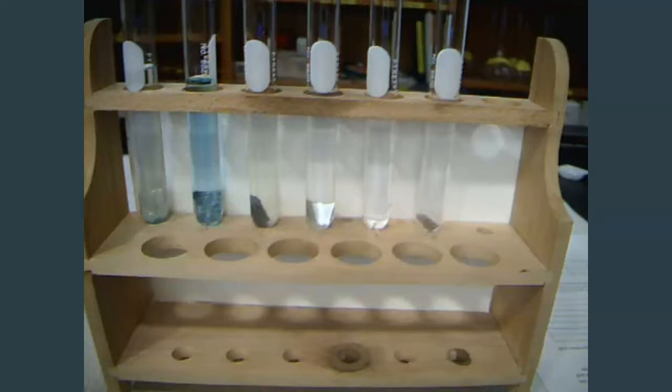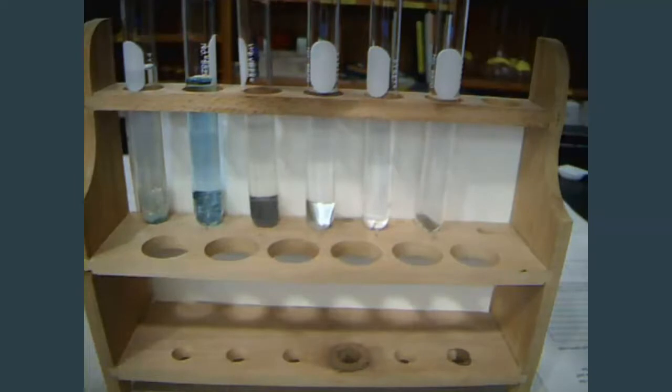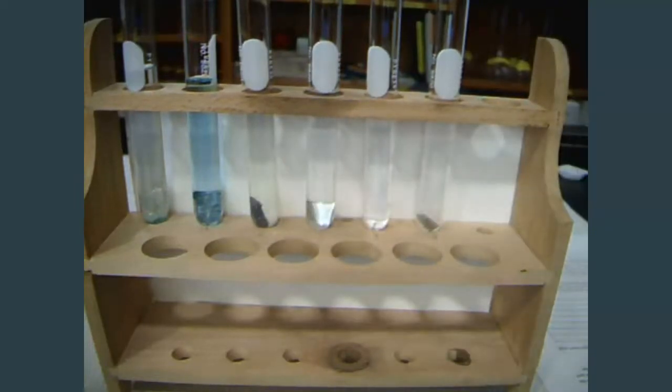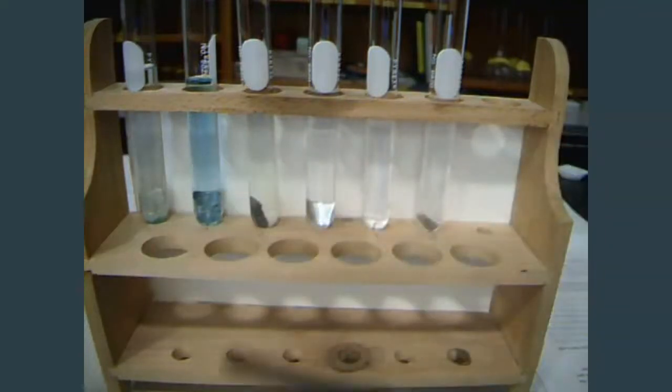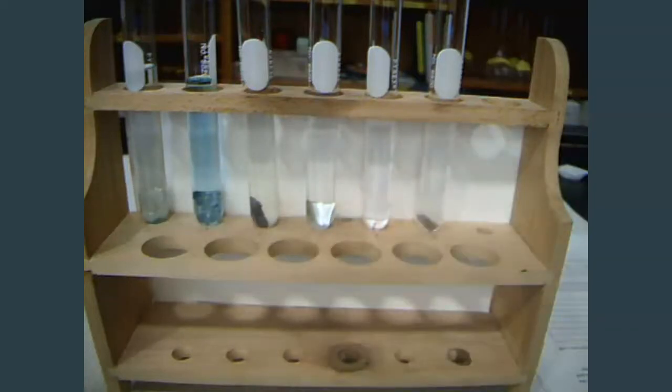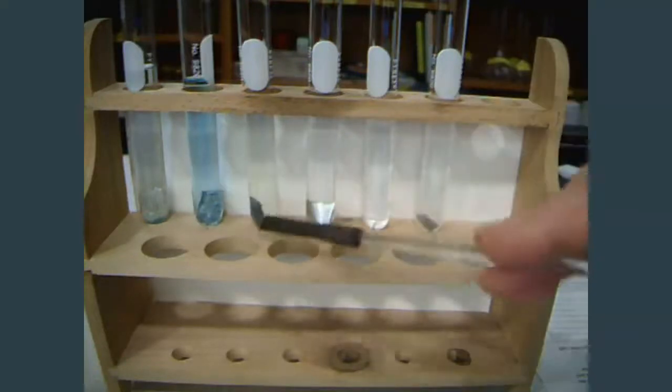Same thing in number three with the zinc and the lead nitrate. We can see all of these crystals growing onto the lead. So it looks like we definitely have a reaction in test tube one, in test tube two, in test tube three. We have a color change. In addition to the color change, we also have these crystals growing on there, a precipitate being formed.